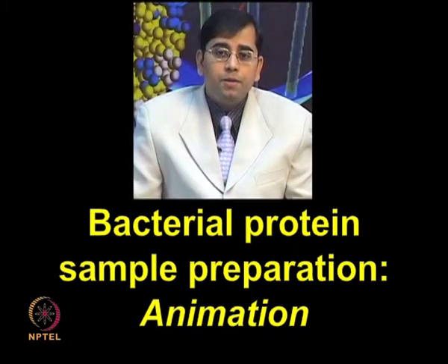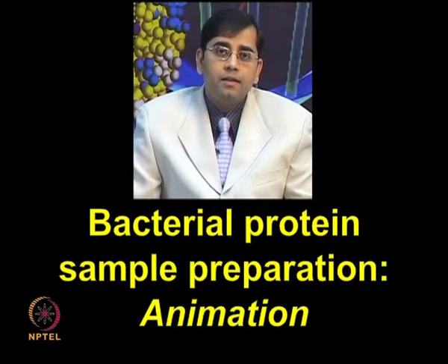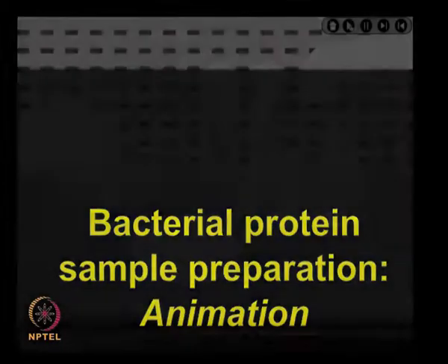So, let me show you the bacterial protein sample preparation in the interactive animations.